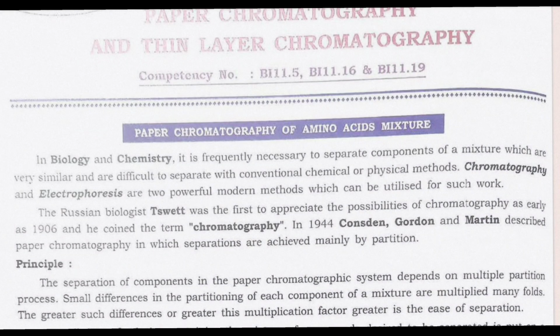In biology and chemistry, it is frequently necessary to separate components of a mixture which are very similar and are difficult to separate with conventional chemical or physical methods. Chromatography and electrophoresis are two powerful modern methods which can be utilized for such work.